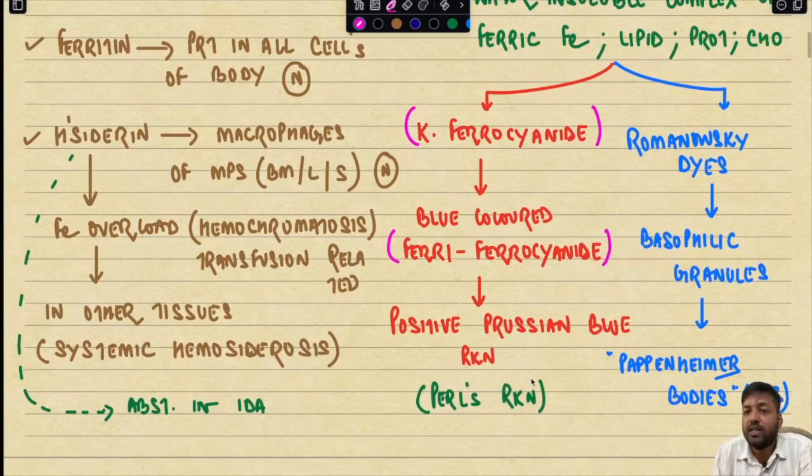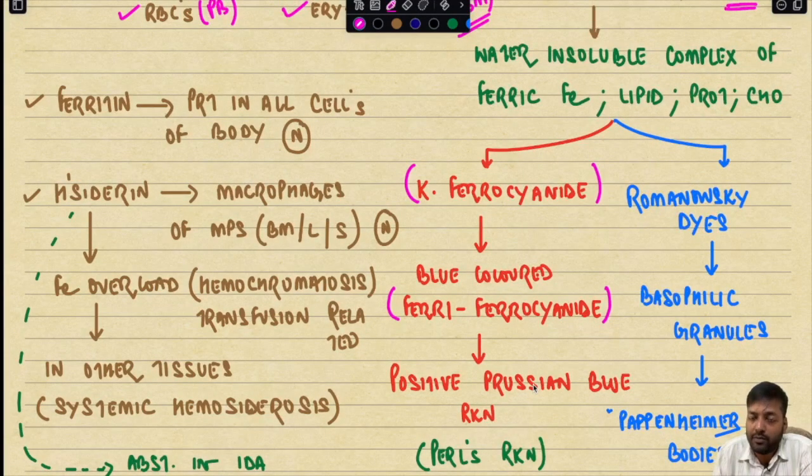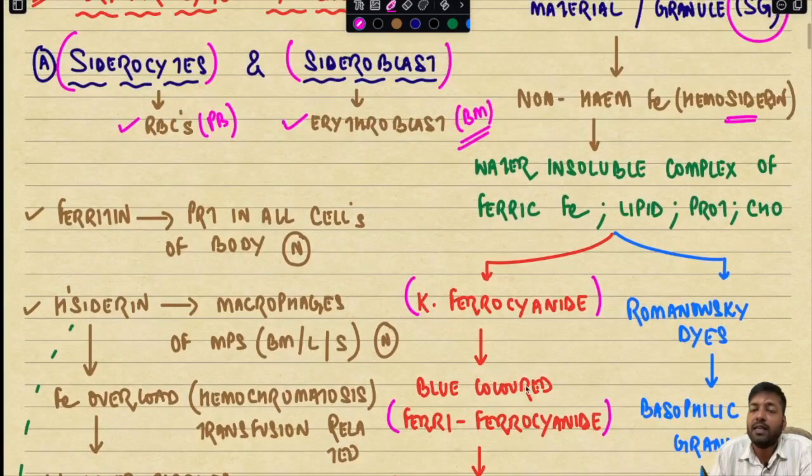Usually this Prussian blue stain or Pearl's reaction is mainly carried out on bone marrow films or bone marrow smears, and it is done for detection of iron, that is hemosiderin, inside macrophages, or lying freely inside the bone marrow, and also for detection of siderotic granules.